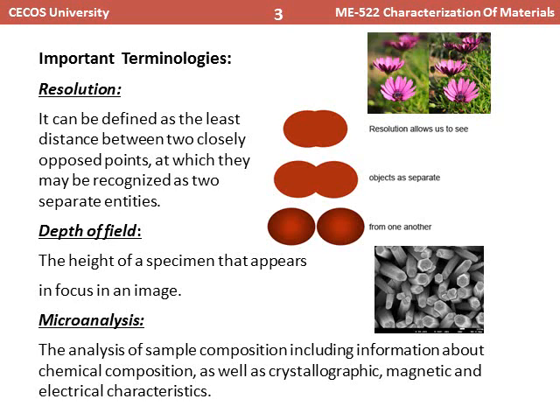So we can say that the image at the right-hand side has better resolution as compared to the image at the left-hand side. So this gives us a thought about resolution. Resolution is nothing but the ability to distinguish objects which are closely packed to each other.